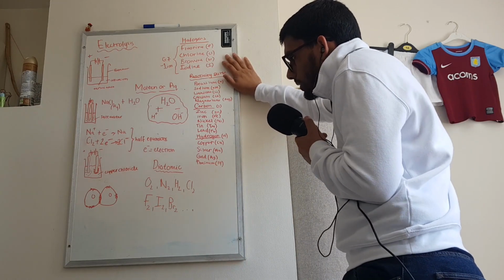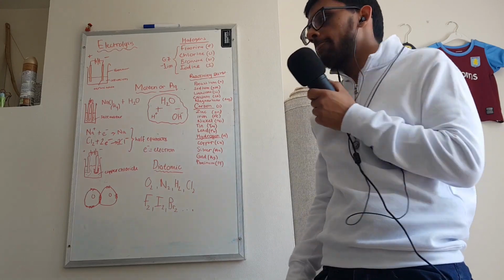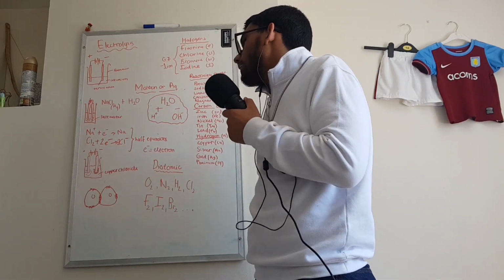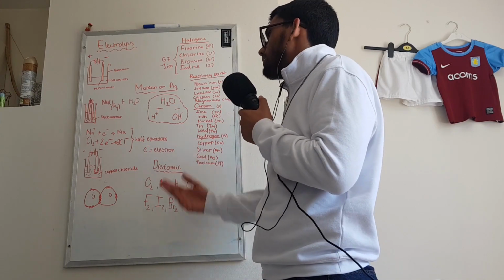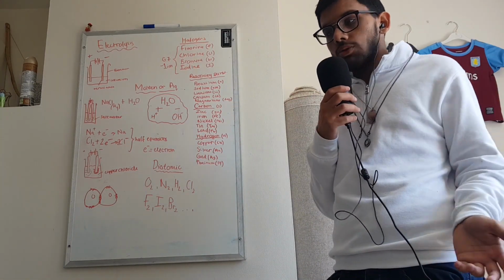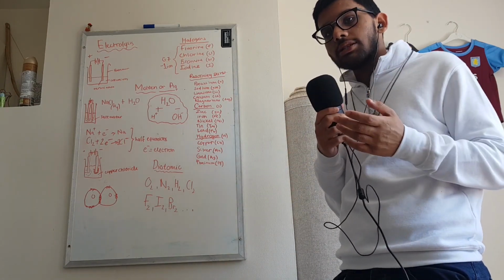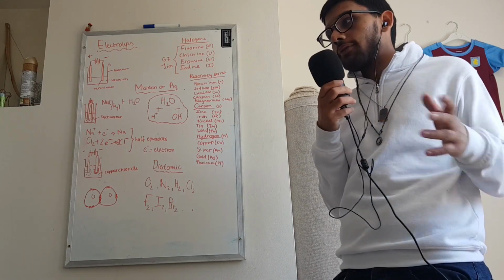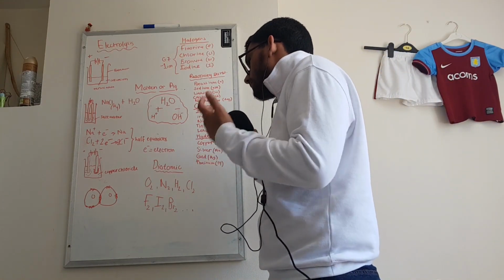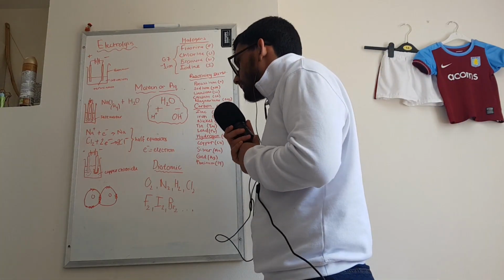Well, what you'll have is oxygen will form. So this OH group will break down into oxygen 2 minus, and the oxygen will then react at the positive terminal, forming O2 gas, which will then react with the carbon inside the terminal. The terminals are made out of graphite or graphene, and the carbon will react with the oxygens to form CO2, carbon dioxide, the thing that's slowly killing our world.